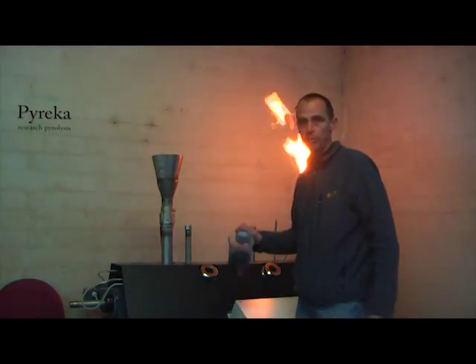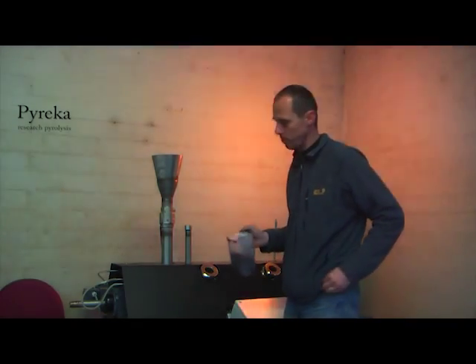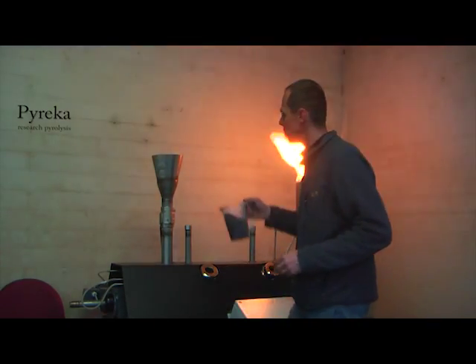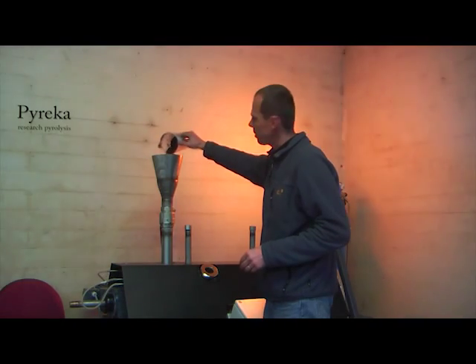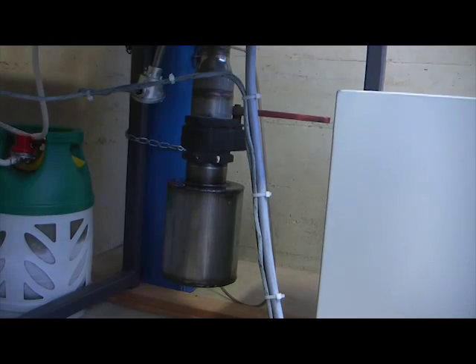Here for example we have coffee seeds, and we can use all kinds of blendings and humidity adjustments. This is coffee seeds with iron sulfate to make magnetite and magnetic biochar. The exit of biochar is here.